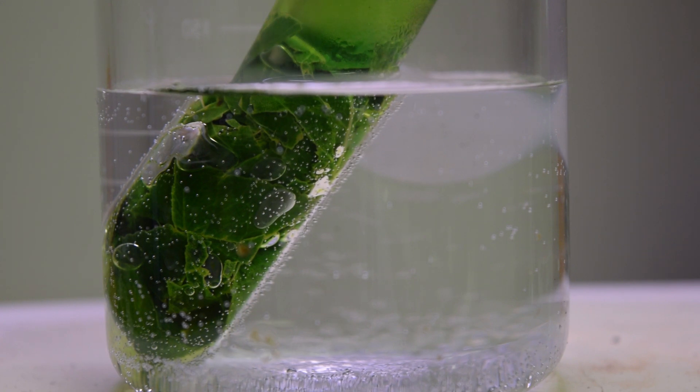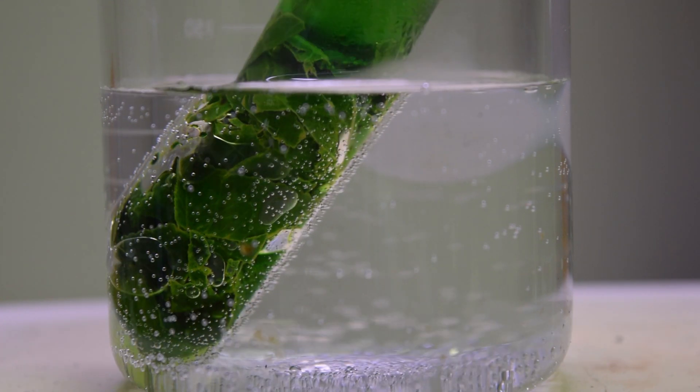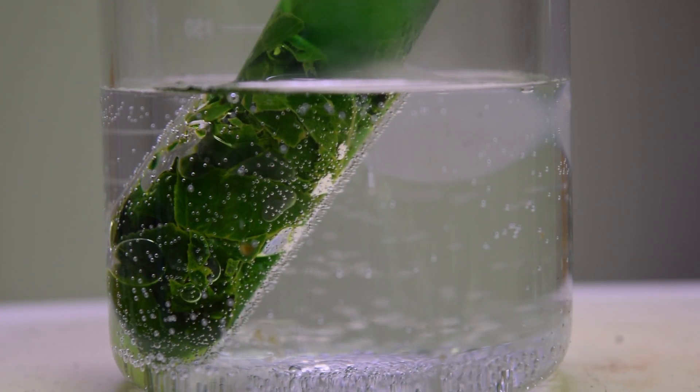The ethanol will begin to boil and the dissolution of chlorophyll will start to turn the ethanol a very dark green color.